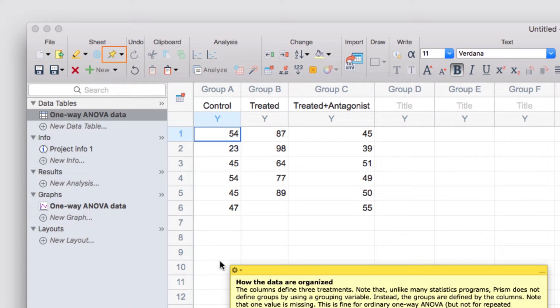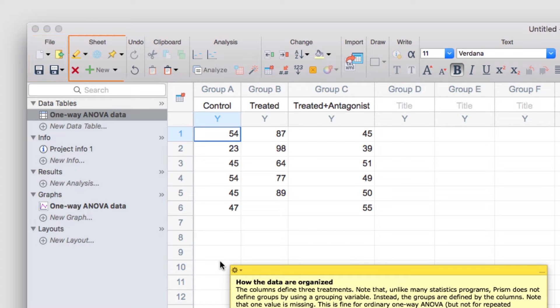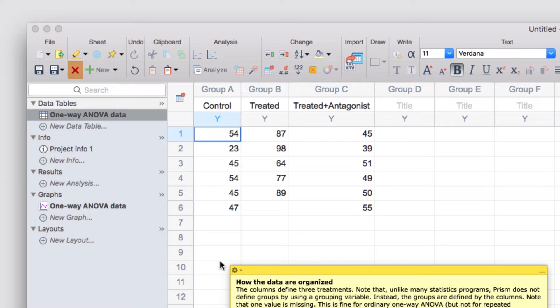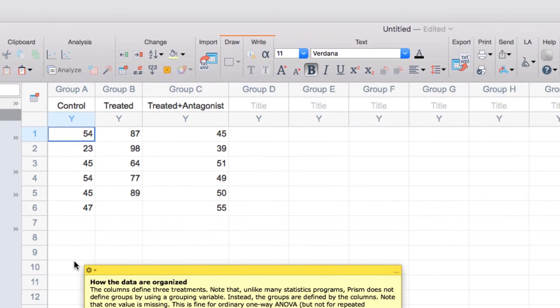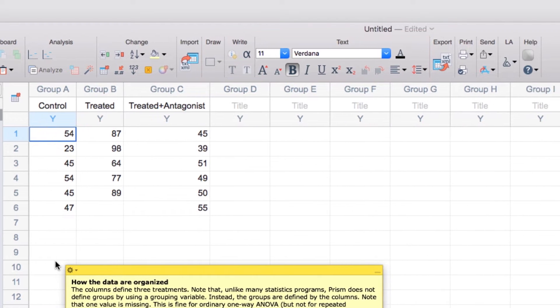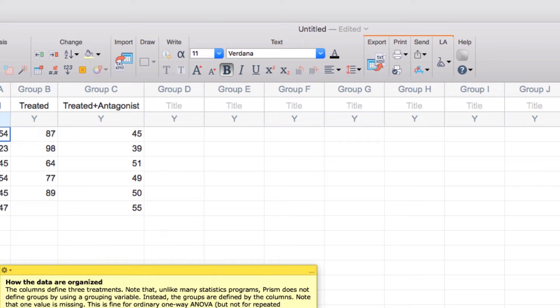Other important sections of the toolbar include the file section where you can create new projects or save your work. In the sheet section, in addition to creating floating notes, you can highlight sheets, create new sheets, or delete existing sheets. The analysis section we'll come back to in just a moment. The draw, write, and text sections are mainly for customizing your graphs and layouts. And finally, there are a number of sections that allow you to export, print, and share your work.